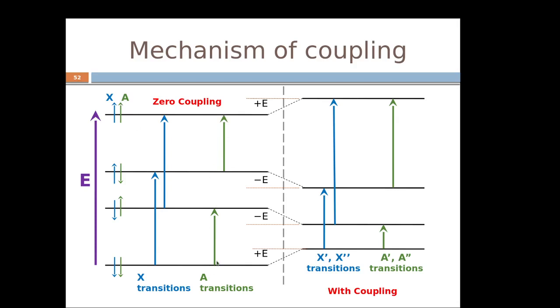And if you estimate the energy required for both the A transitions, you can see that the energies are equivalent. So this means that in the NMR spectrum, both the A transitions would appear at the same frequency in the chemical shift scale. You will see just one peak for the A nucleus in the NMR spectrum. So this happens in the absence of coupling between the A nucleus and X nucleus.